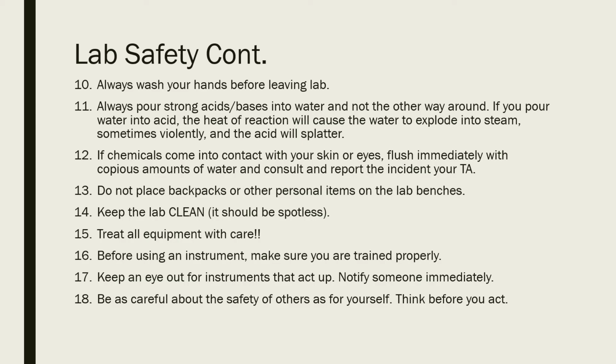Make sure to always keep the lab clean and not place backpacks or other personal items in a way that people could trip on them. The last thing we want is people holding some kind of chemicals and tripping and dropping it all over the floor. Always treat your equipment with care. Even small pipettes that we use every day, we have to be very gentle with them because they are delicate machines.